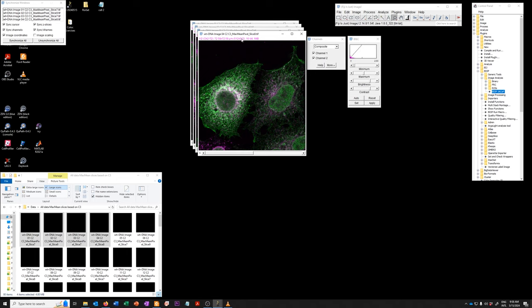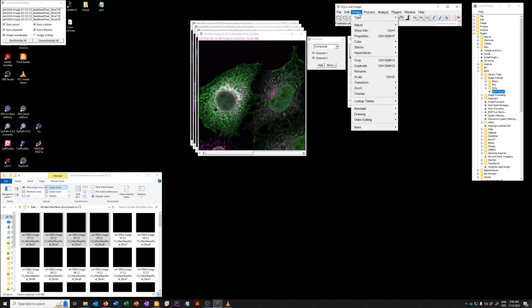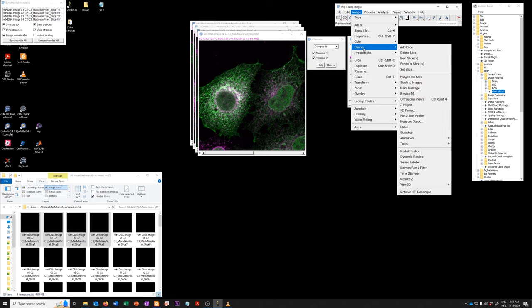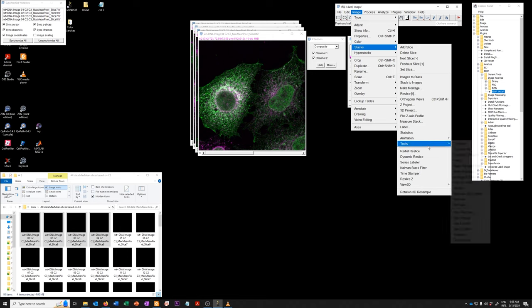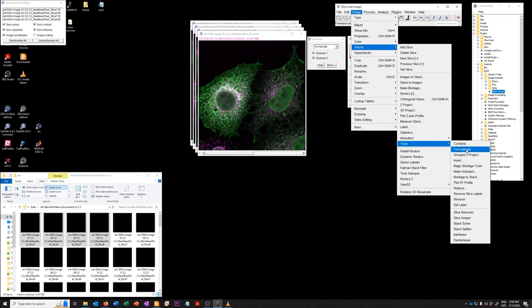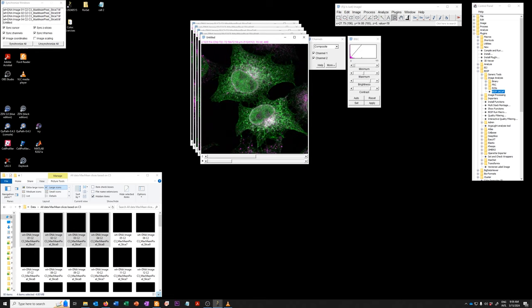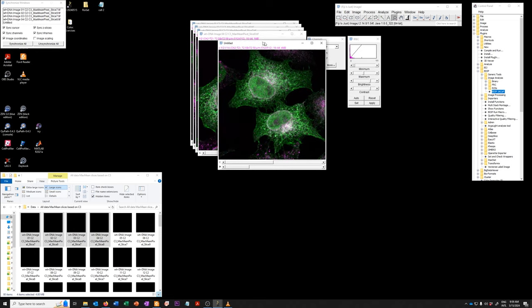We want to concatenate them, so we want to put them together into a single stack. How do we do that? We use the following tool: images, stacks, tools, concatenate. We can say do all open windows if we have more than the ones that show up here. We can decide to keep the original images if we want to have the option to go back to them. I'm going to say OK, and you'll see what happens.